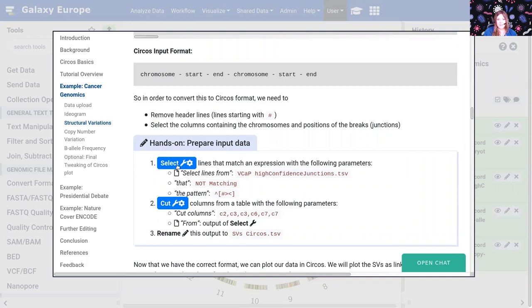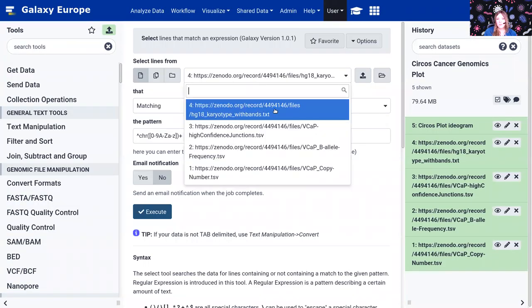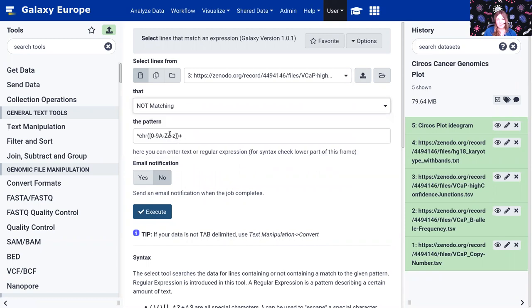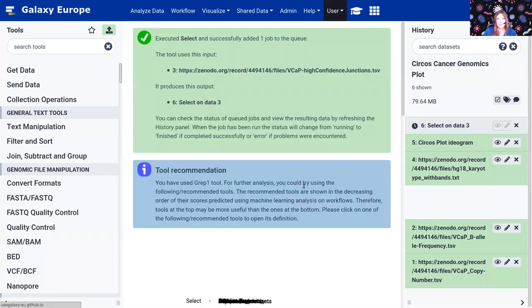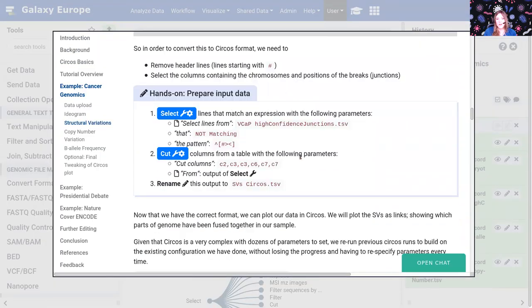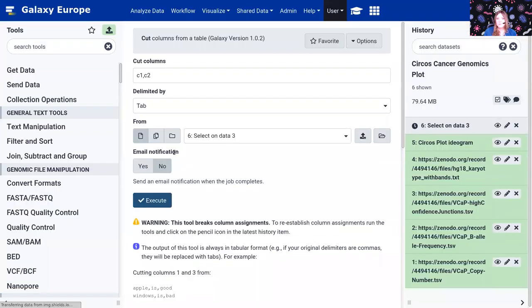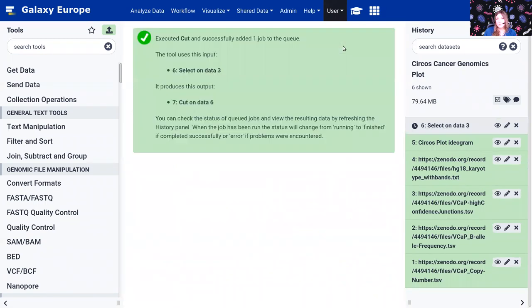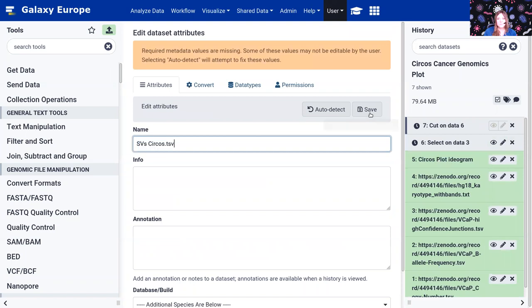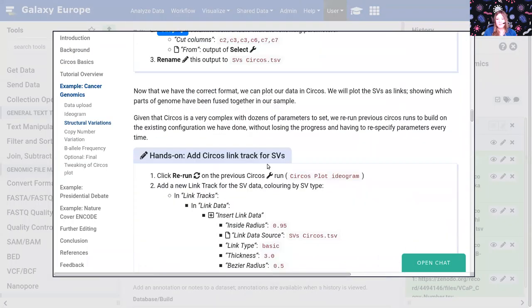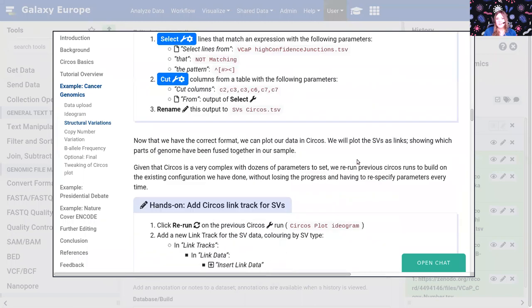So we're going to take our VCAP high confidence junctions and select everything that does not match this pattern — this pattern looks for any of these three characters at the start of the line as the first character on the line. So let's execute that. And then we're going to cut some columns from that file, cut those columns from the output of our select tool, and they suggest we rename this to structural variations Circos, which we can go ahead and do now.